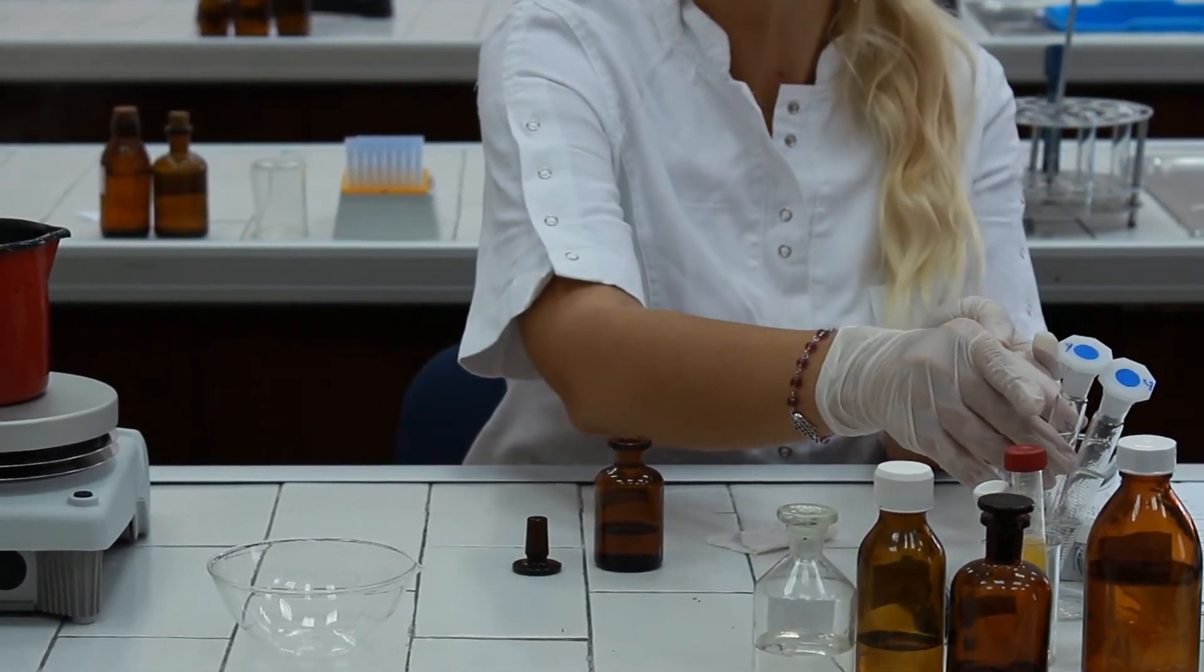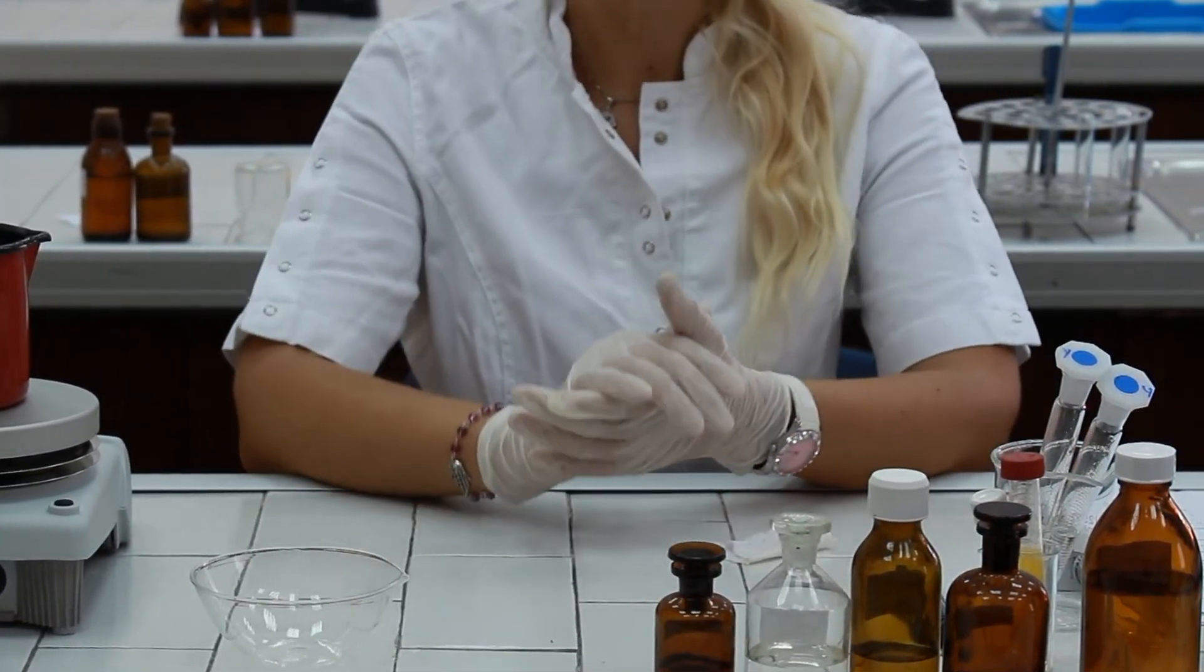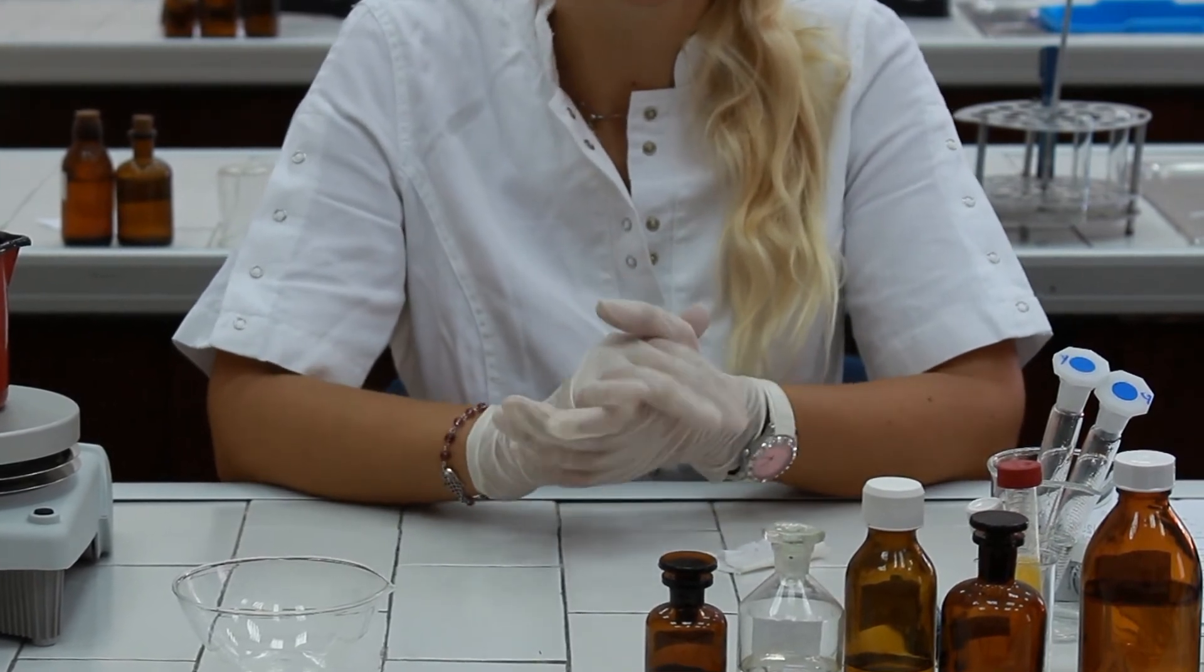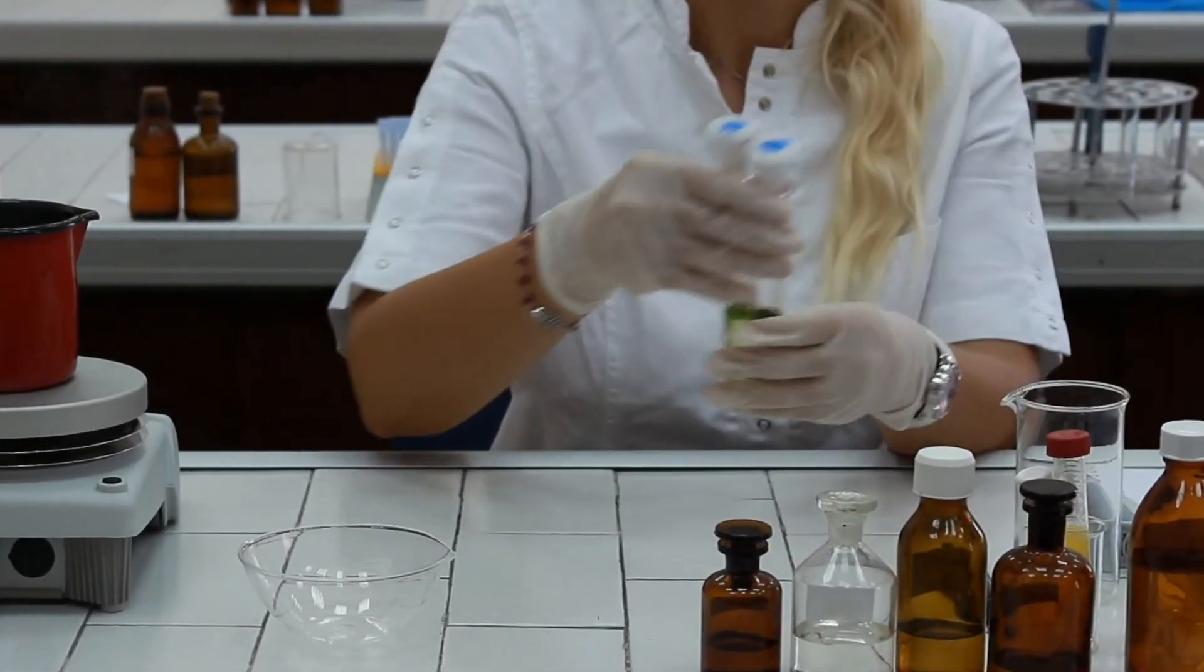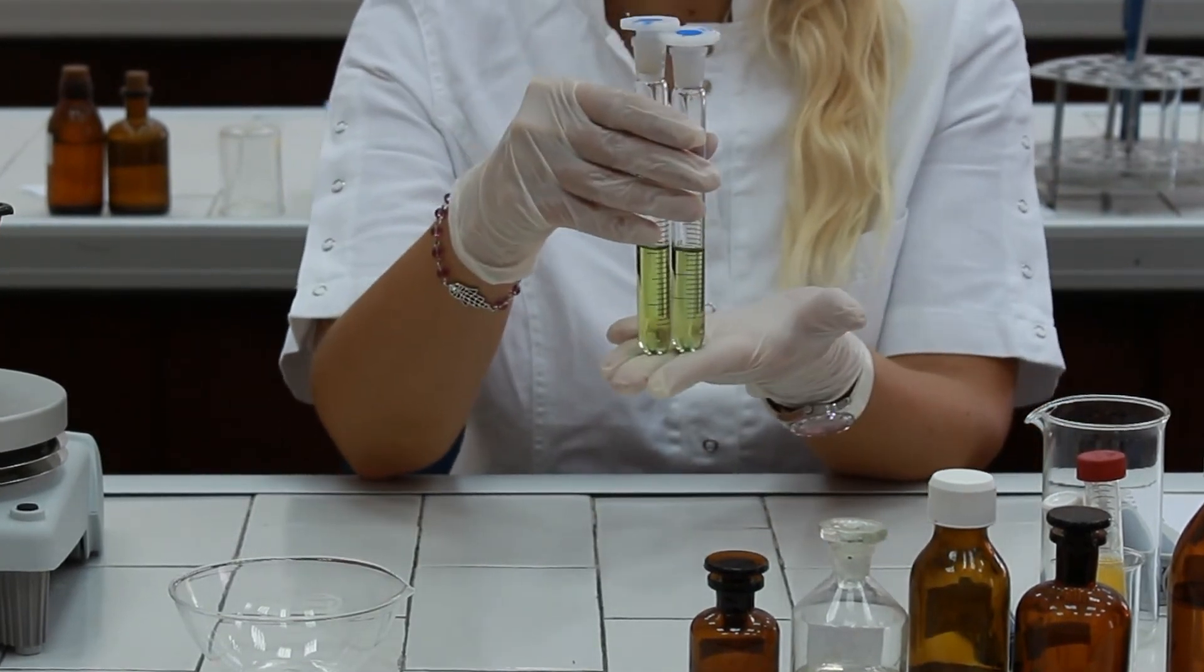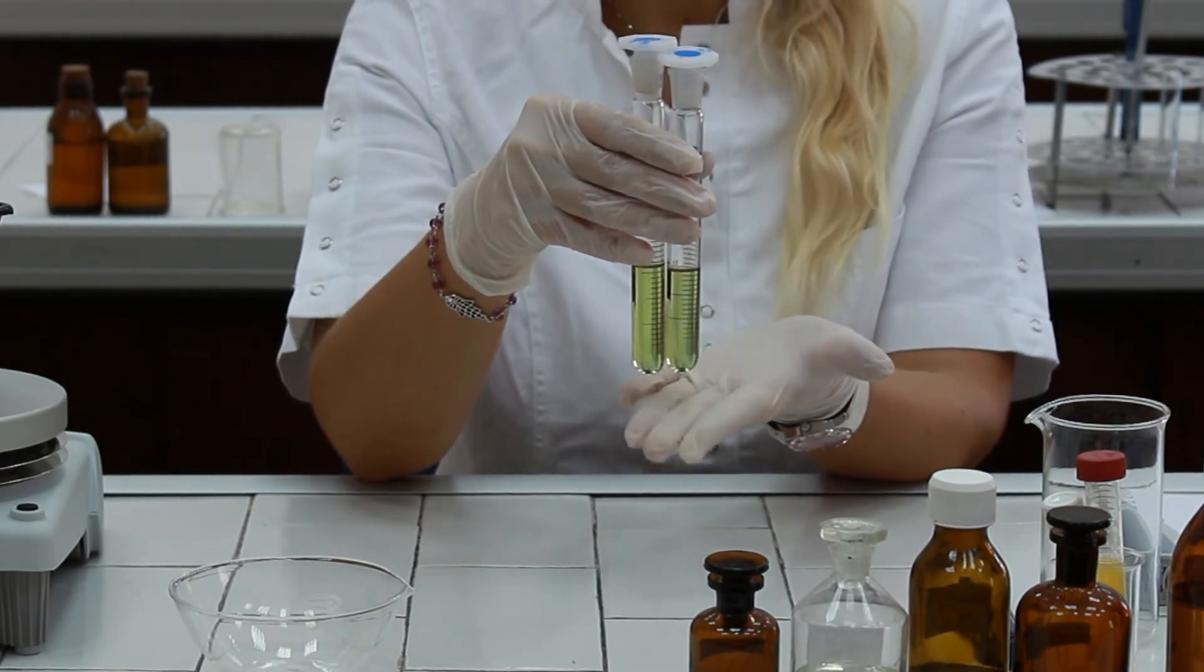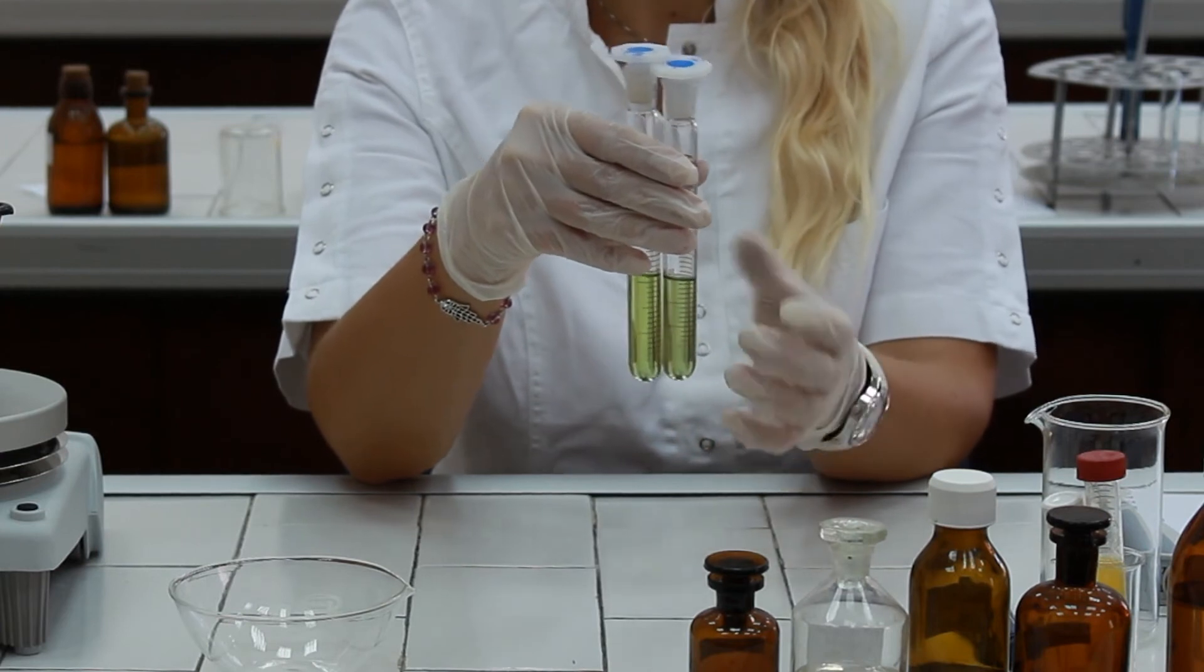In order for the green color to develop, we need to place graduated cylinders in darkness for at least 15 minutes to half an hour. After 15 minutes to half an hour, we get the developed green color as a product of this reaction. Now we can read the absorbances by using the red filter.